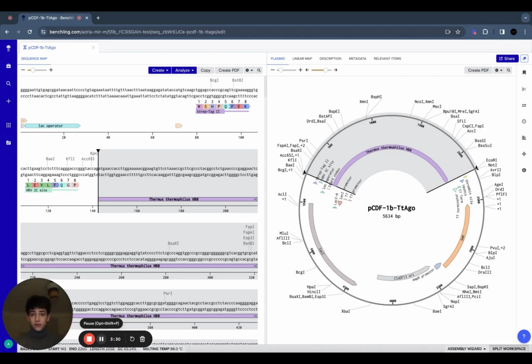And secondly, if you don't know what a plasmid is, it's just a circular piece of DNA that's found in bacteria. Get ready to run the digest. We need two different sites for the cleavage to occur. I have the KpnI. As you can see, we have the 4 base pair overhang that I mentioned, which is a sticky end. You've got a GTAC.